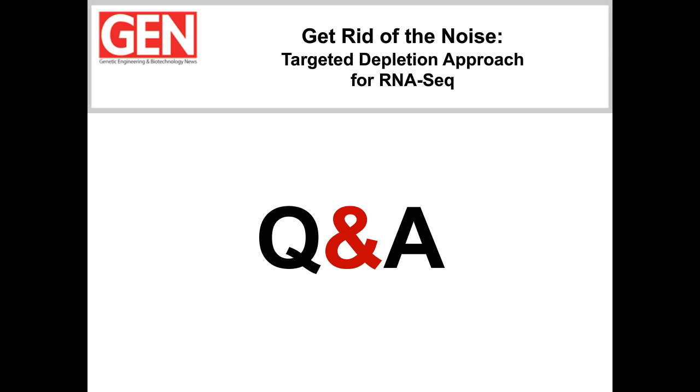In terms of deviations from standard parameters, we do have a custom read-1 primer that comes with the kit. That can be used if you are sequencing solo libraries alone. However, if you want to pool these solo libraries in a sequencing lane with non-solo libraries, that can also be done. For that, we recommend pooling solo libraries to no more than 60% of the total input. And in that case, sequencing can be done using the standard Illumina read-1 primer.